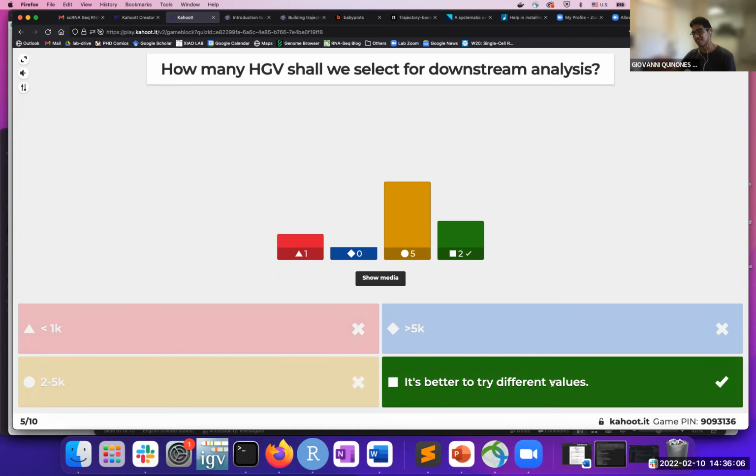And this is the right answer, because I don't want you guys to have this pretty much random value in your head, and because they said 2 to 5 is good, so I'll do 2 to 5. When the real message we're trying to teach is that, because this is an arbitrary value, it's good that you try different ones. So let's move on.